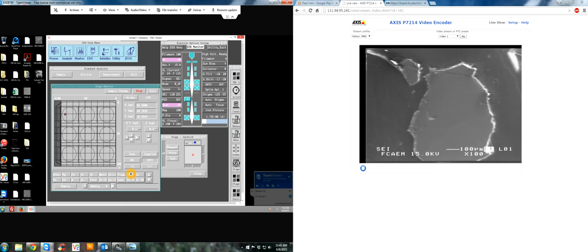And the way you do this, say you've spent some time finding the standard and you found it and you want to add a quick click button to move directly towards the sample, what you would do is hit this memory button, and then you can change any of these, say magnesium here, and under comments type in, you know, olivine, and then hit load position, and it'll load the XYZ coordinates, and hit apply.